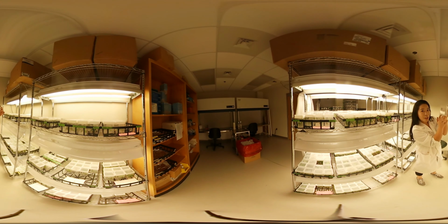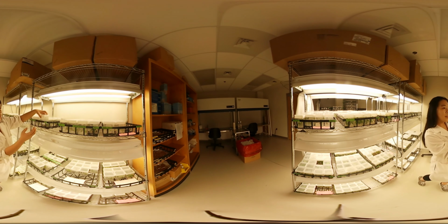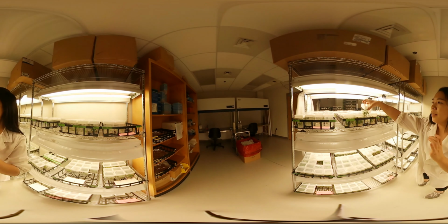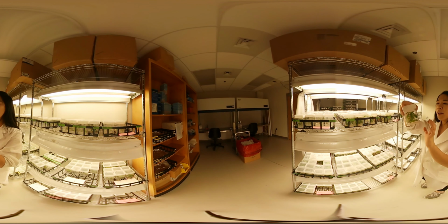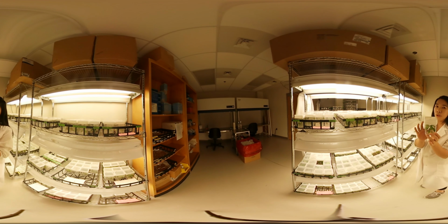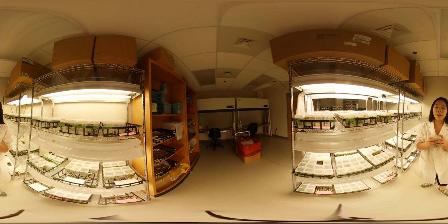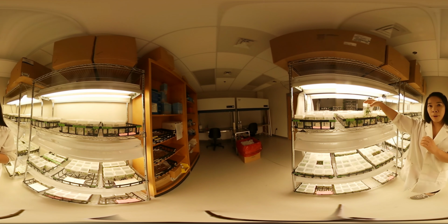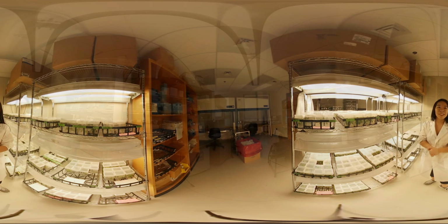And this medium you can see here contains all the nutrients the tree needs to grow. Then after 2 or 3 months, they can grow this big. See here? Later on, we transfer them to the greenhouse and grow them for 3 to 4 months, and then we will collect samples and do the analysis work.